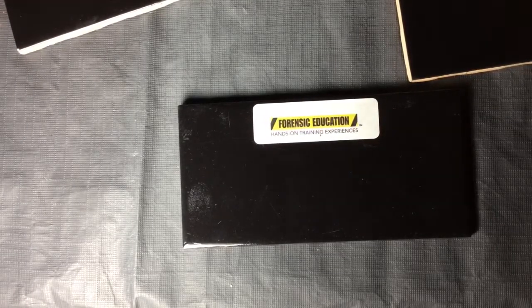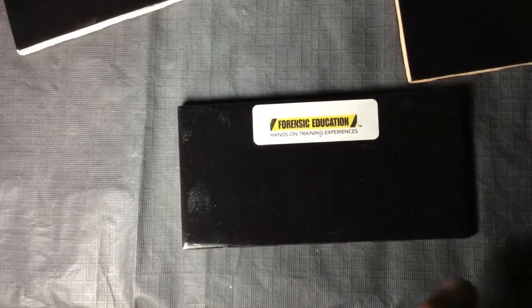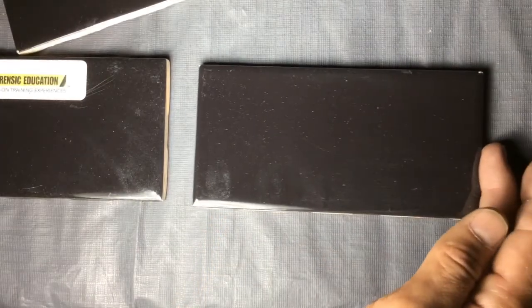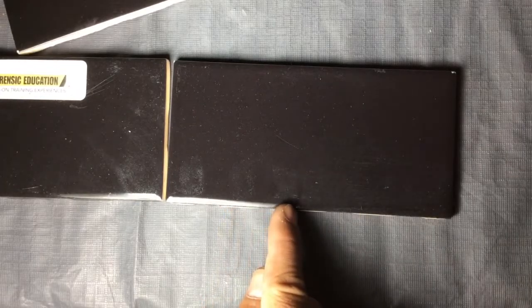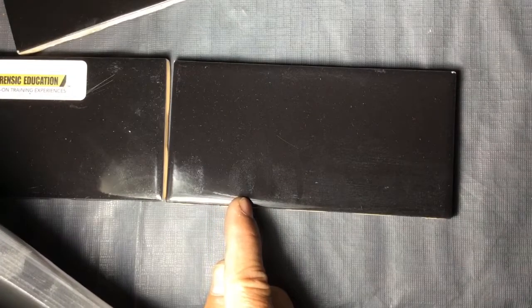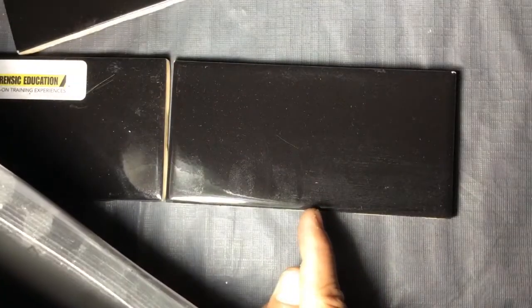Here's the silver and white powder results. You can see that one first print, but as I go across the series I only see a couple of little smudges — nothing amazing. On the second tile, the first print is showing up and I see a couple of outlines, but nothing with any significant detail. There's one here with some detail. I would say out of all of those, I have three workable prints I'd be able to try to lift using the white or traditional powder.